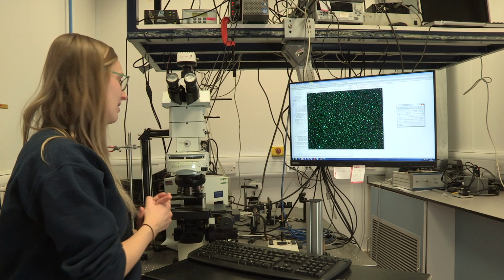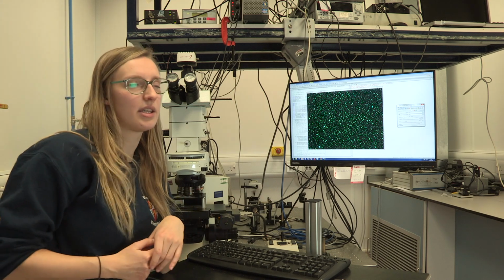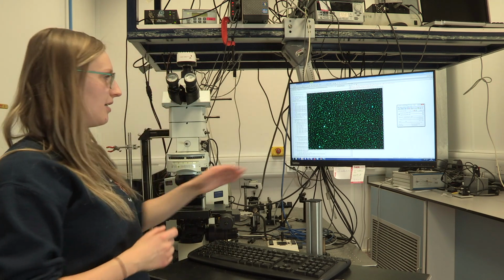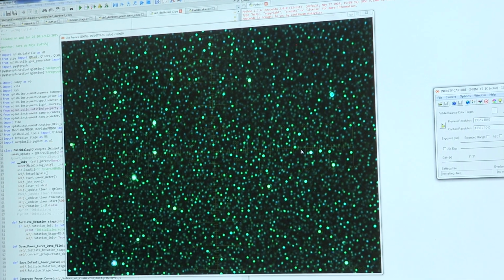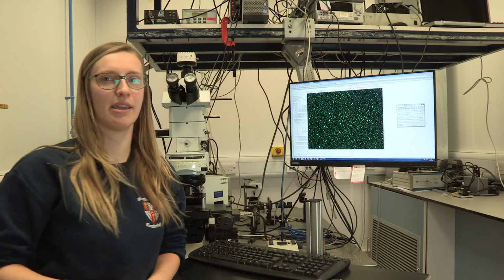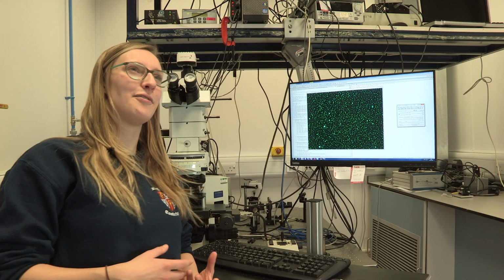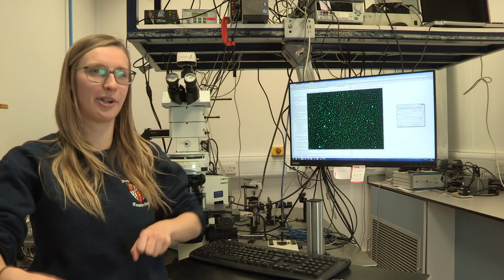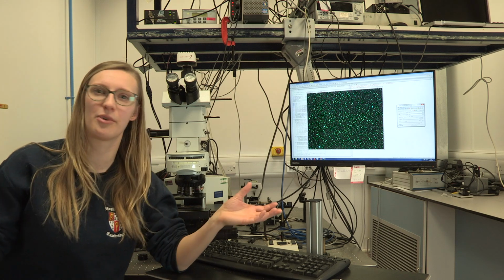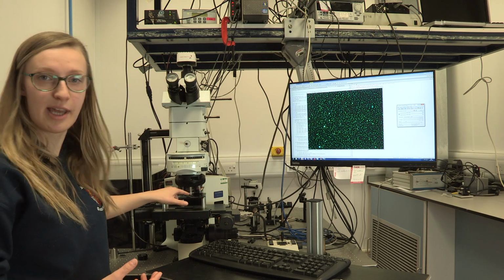The way that we've done it here is in quite a kind of fancy pants way. So you can have multiple lasers, so you've got different colors of light going in. And this image here is actually my sample. So I do something called surface enhanced Raman spectroscopy, which is, I just explained Raman, I just sort of explained spectroscopy. So surface enhancement is if you put the things which are shaking and wiggling and breaking next to something like gold. It turns out that when you shine the laser on, the laser has way more of an effect than before. So this way more of an effect is due to this sample.